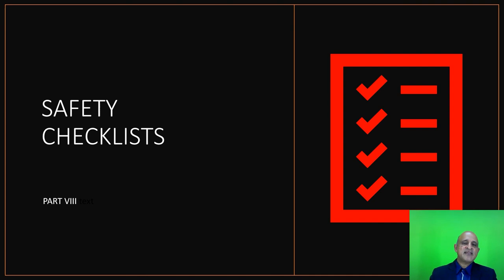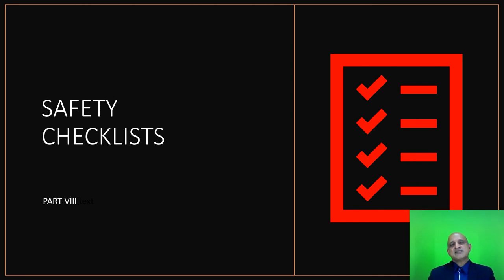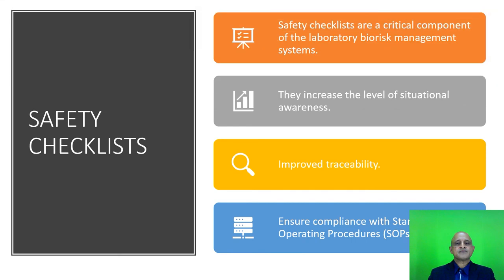Safety checklists are a very important component of any laboratory because they ensure situational awareness. For instance, if you are working in the laboratory on the workbench or biological safety cabinet and are accompanied by a colleague in a buddy system, your buddy is responsible for ensuring that you comply with the safety checklist. This is done from a safety perspective to ensure traceability of all operations. Safety checklists increase the level of situational awareness, improve traceability, and ensure compliance with standard operating procedures.